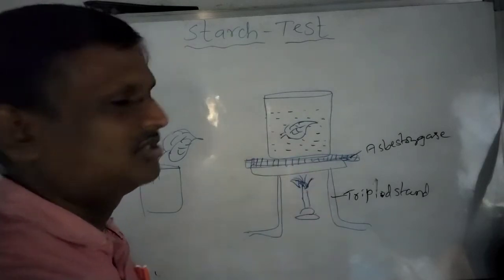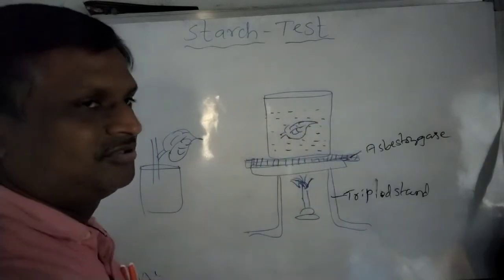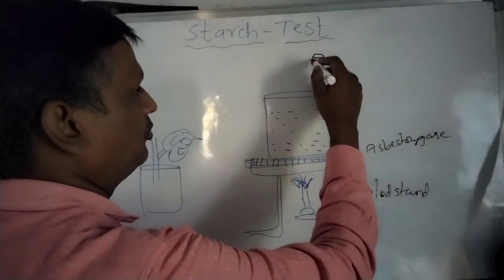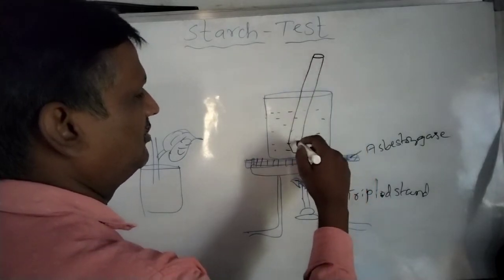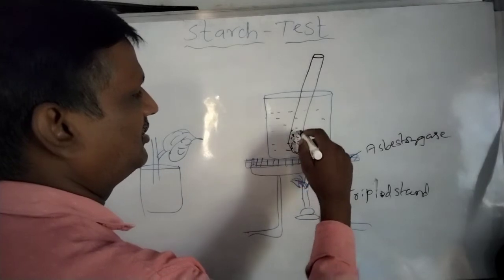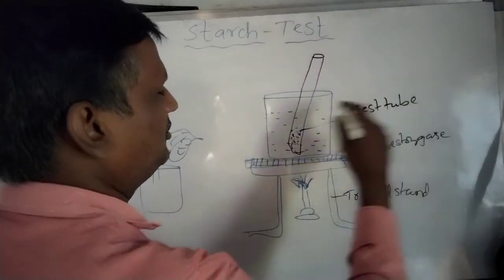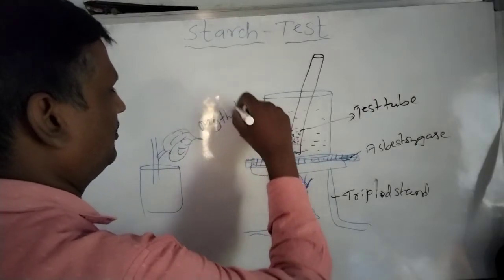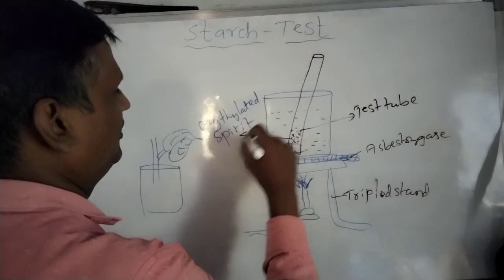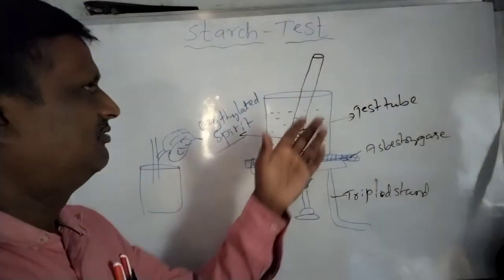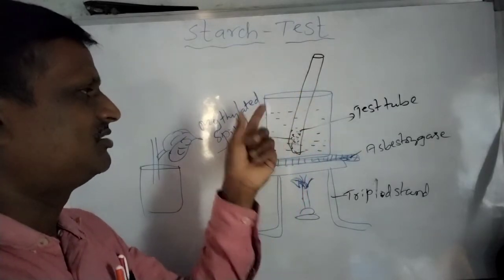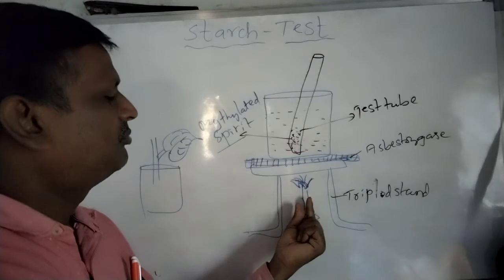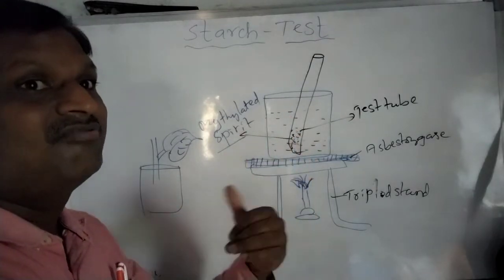After some time, this leaf should be transferred into a test tube or boiling tube which contains methylated spirit or alcohol. The test tube is kept inside the beaker of water rather than directly on the Bunsen burner because methylated spirit is highly inflammable.